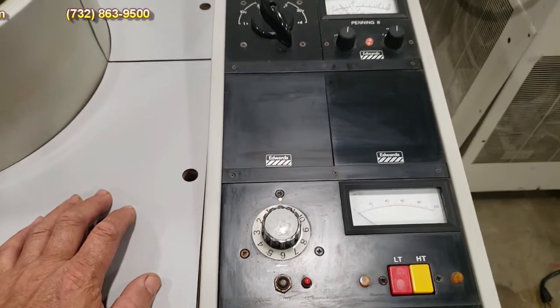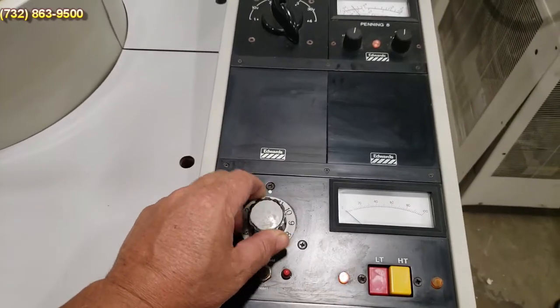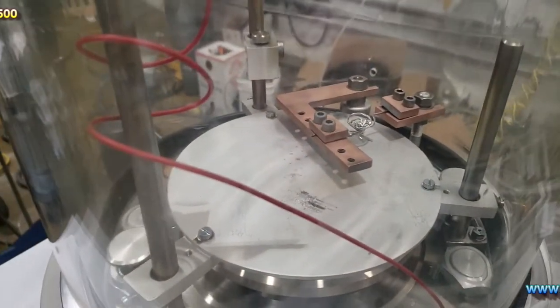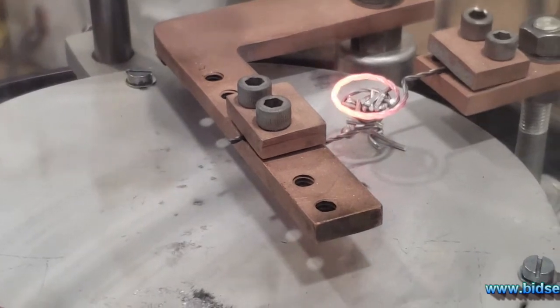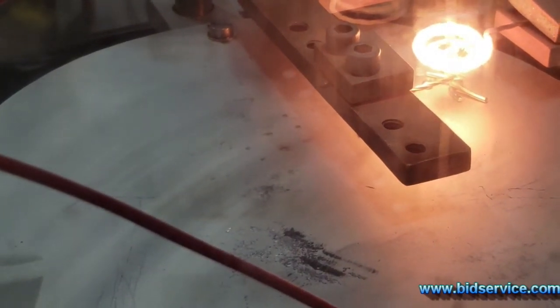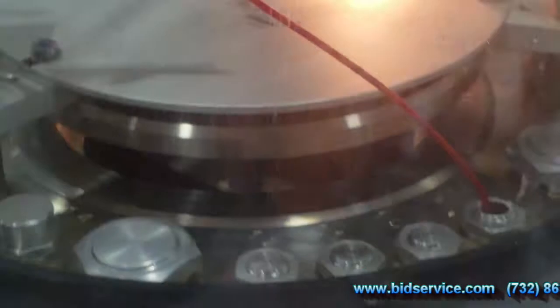Down here is your low voltage transformer filament source. What you would do is turn this on — low transformer — and you could turn this up. As you can see, your gauge up here will come on. I'm going to raise it a little higher and you're going to see that little filament right there start glowing. There are aluminum pellets in there and I'm going to glow it until those pellets start melting.